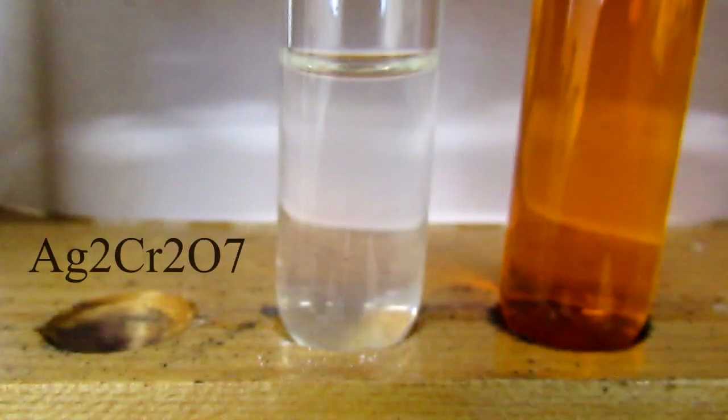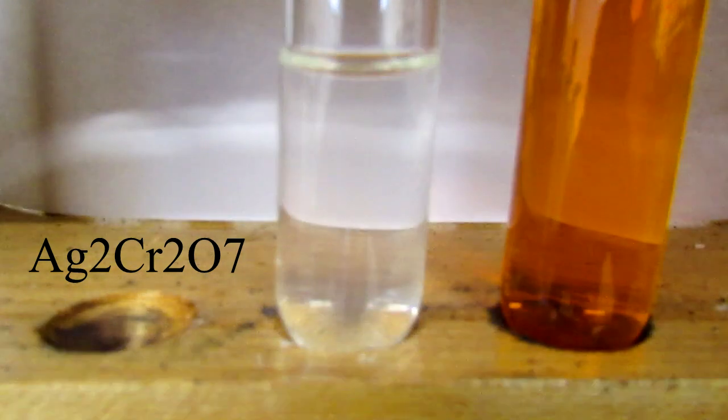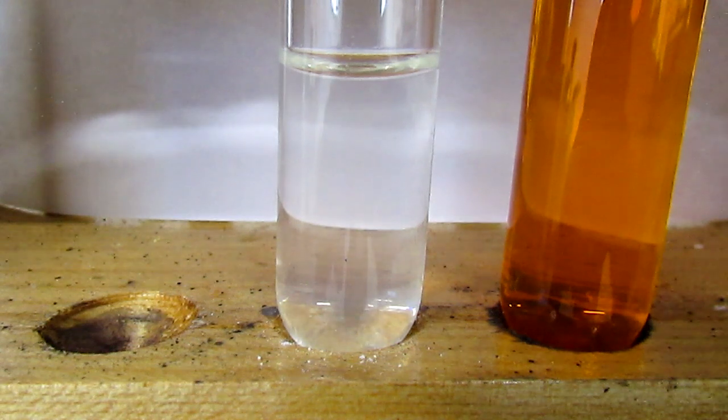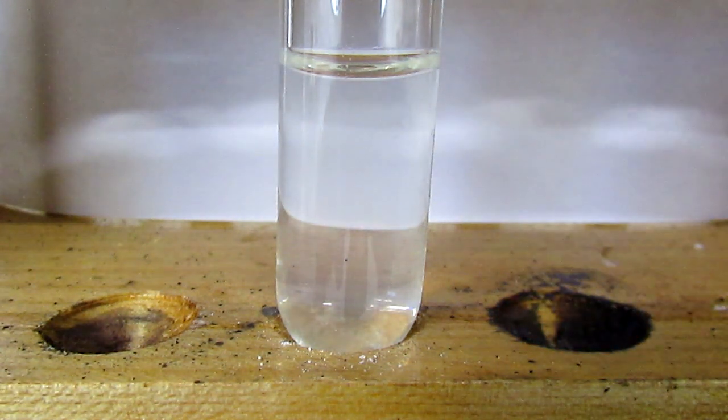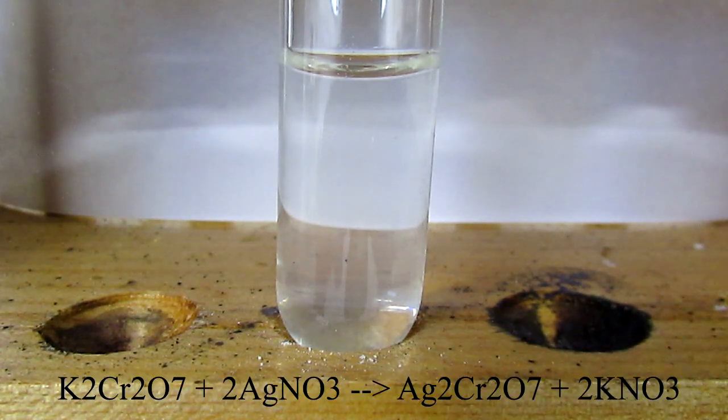Today we are going to be preparing silver dichromate. On the left I have a solution of 0.5 grams of silver nitrate and on the right I have a solution of 0.45 grams of potassium dichromate. I'm just going to drip the dichromate into the silver nitrate and we should see a red precipitate.